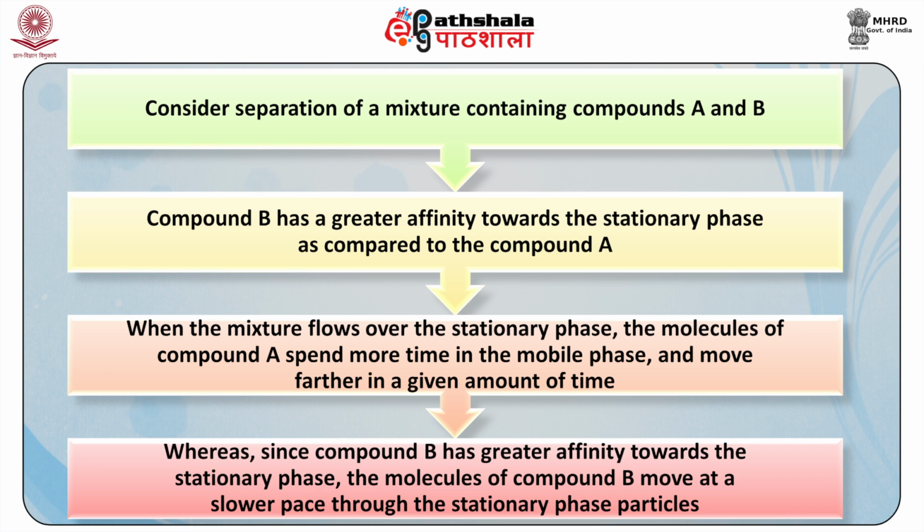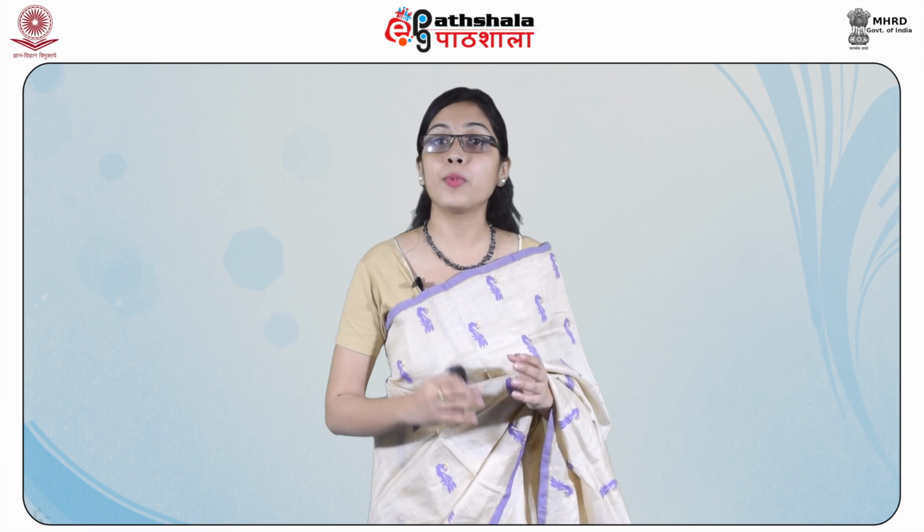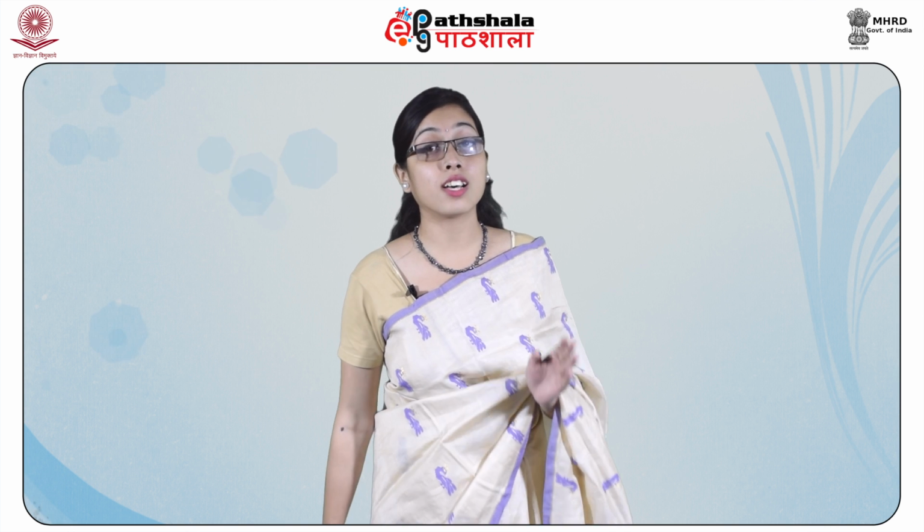When the mixture flows over the stationary phase, the molecules of compound A spend more time in mobile phase and move farther in a given amount of time. Whereas, since compound B has greater affinity towards the stationary phase, the molecules of compound B move at a slower pace through the stationary phase particles. As a result of this, the components of the mixture can be gradually separated. A suitable solvent mixture can be selected as a mobile phase to achieve the desired separation.